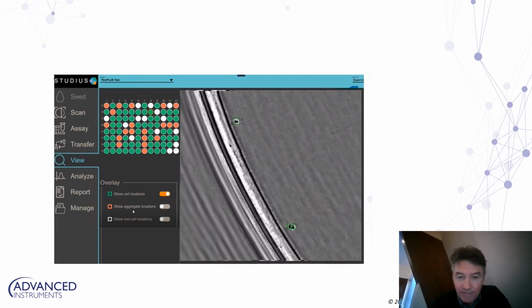In the lower half, we see two separate cells in a doublet, and the AEC algorithm has picked it up as two separate cells and put green boxes around both of them. And this just shows the power of the AEC neural network.